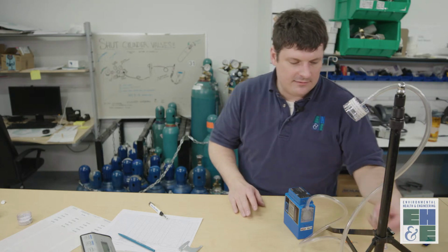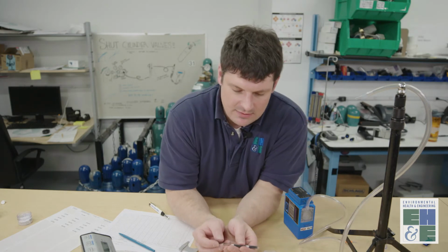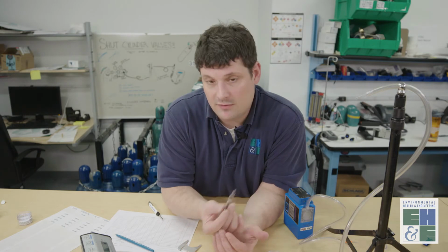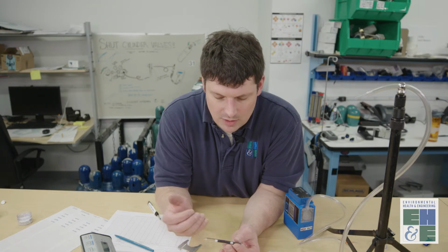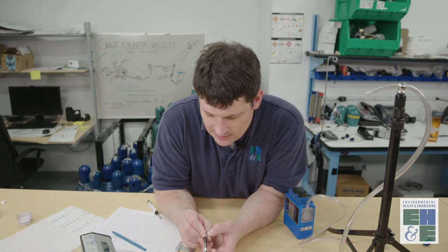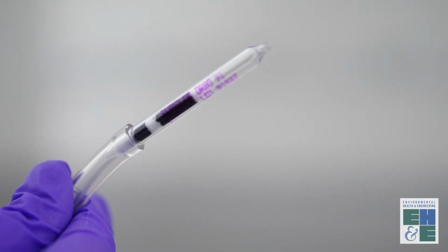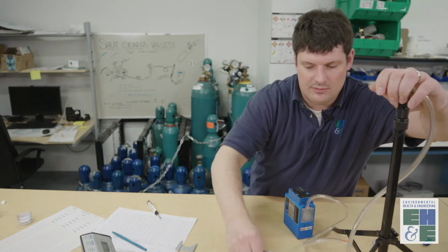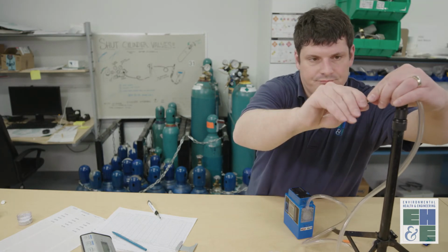We could also collect samples using sorbent tubes. These have to be opened at either end prior to sampling, but the process is exactly the same, where we take on flows and off flows. The only thing with these is it's really important that the direction of airflow go correctly. Every sorbent tube has an arrow that indicates the direction of airflow. In this case, the arrow's pointing towards the pump. When we collect this sample, we don't need the lower adapter, and we can attach the tube like that after it's broken.